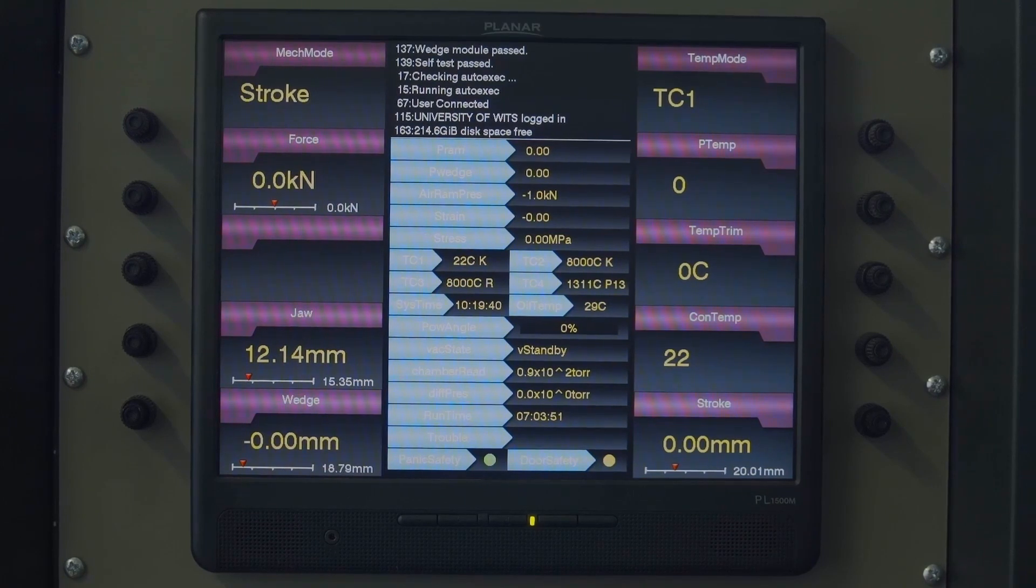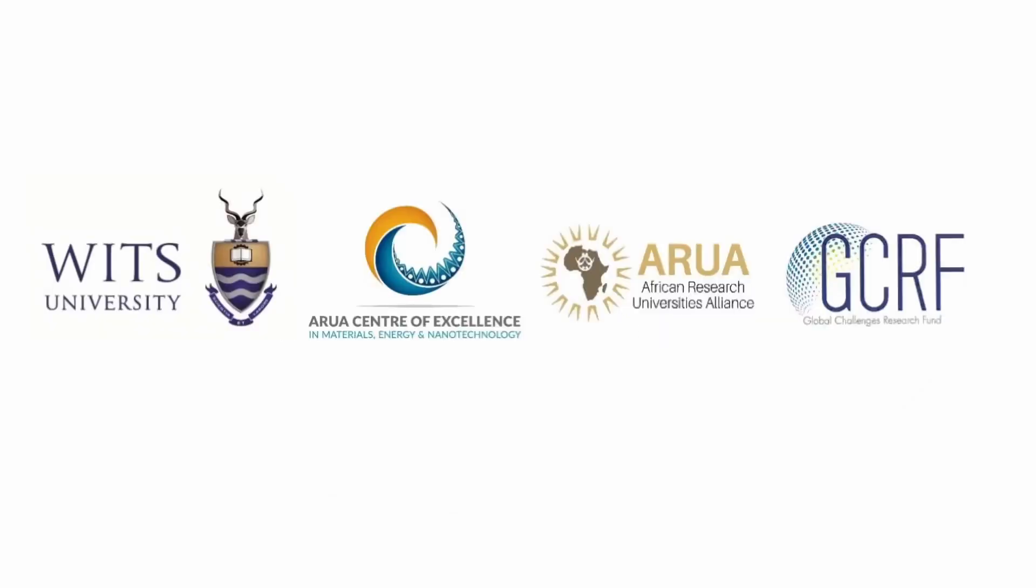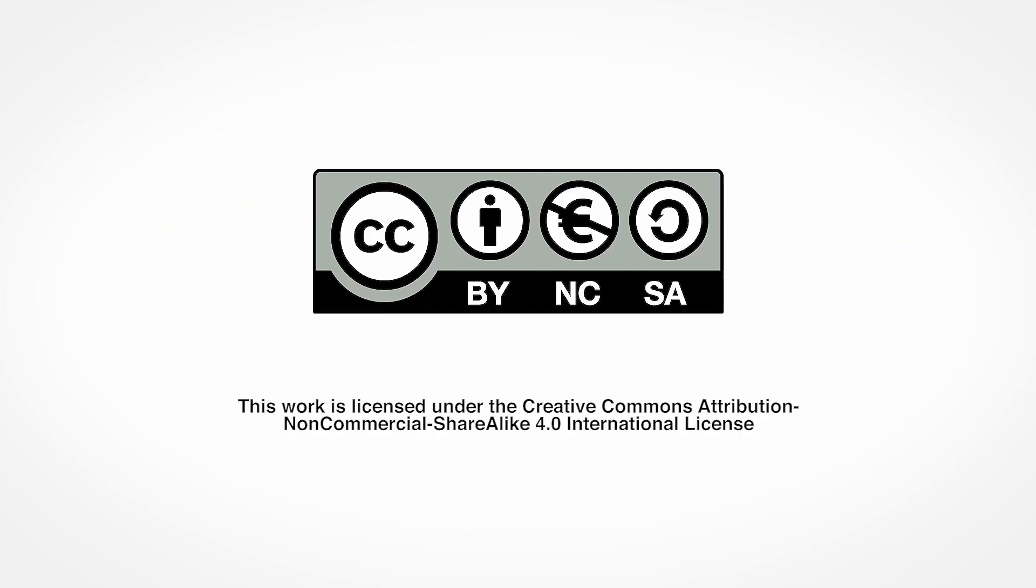But now let's go and set up our parameters for today's test on the computer.